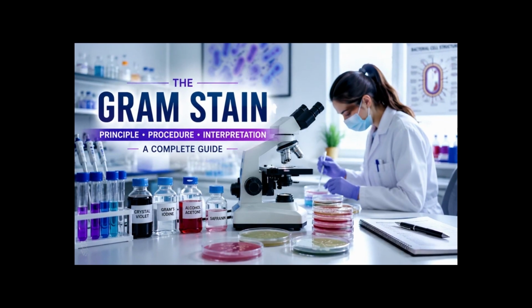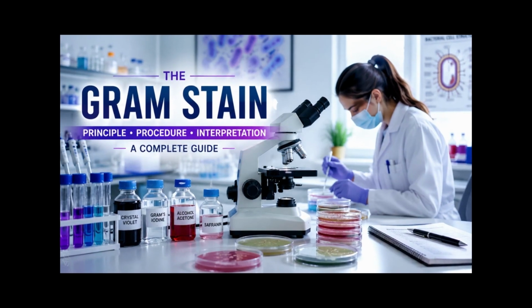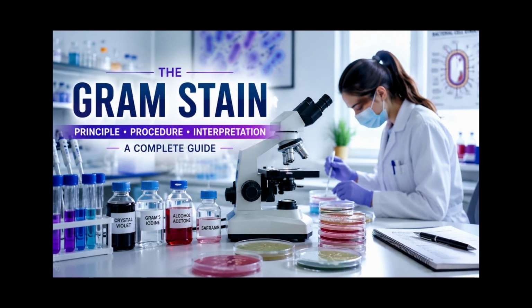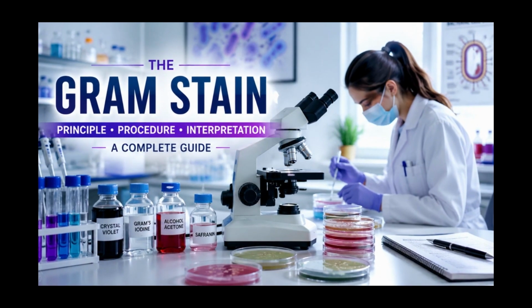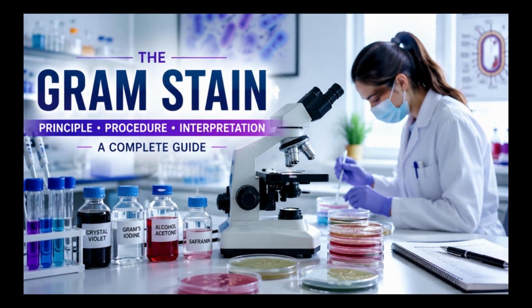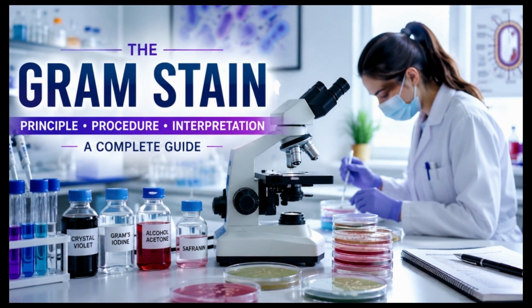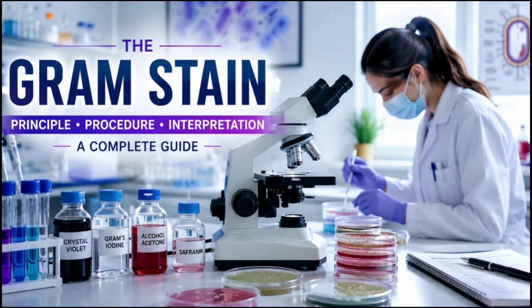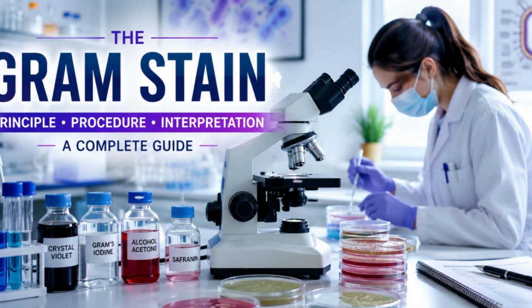Have you ever wondered how microbiologists identify different types of bacteria under a microscope? One of the most widely used laboratory techniques for this purpose is gram staining. It is a simple, rapid, and highly effective differential staining method that helps distinguish bacteria based on the structure of their cell walls. In this video, we will learn the principle, procedure, and interpretation of gram staining, step by step.